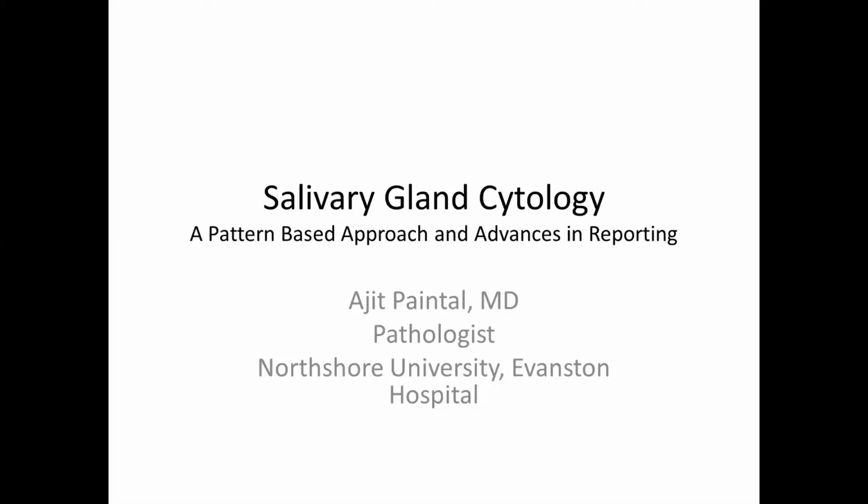As Dr. Vanden mentioned, our topic today is salivary gland cytology with focus on a pattern-based approach and advances in reporting. And I think salivary gland cytology is an important and worthy topic for discussion this morning for several reasons. First of all, it's a relatively common specimen type, but not as common as certain other specimen types in cytology, things like thyroid FNAs, for example. So it's something that we'll pretty much all see on a fairly regular basis, but not in huge numbers of specimens, maybe just a couple times a week.